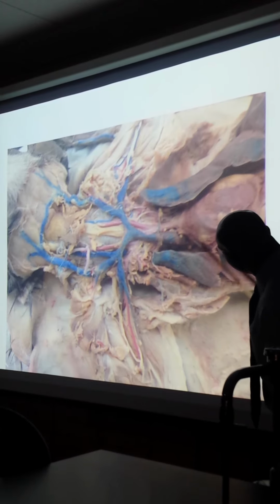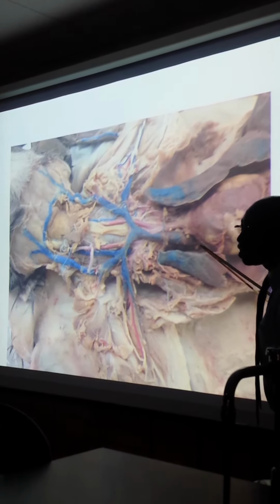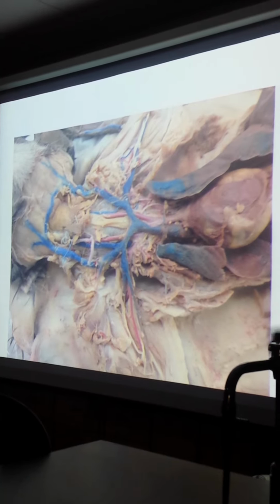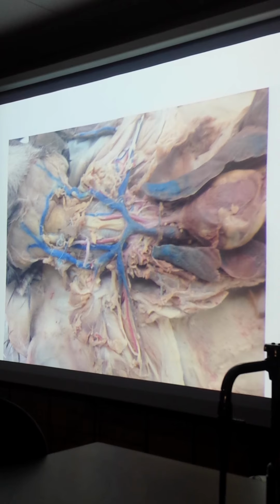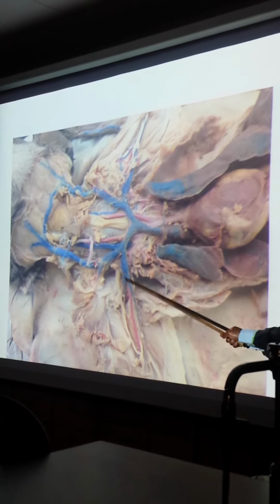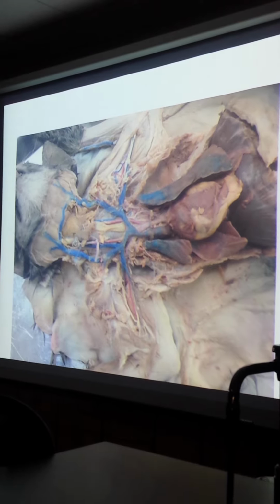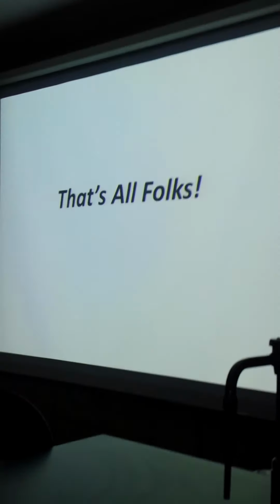Alright? And this time I didn't put my little pin or my little probe for that azygos vein because it comes right out. As soon as the superior vena cava exits the heart, then boom, that azygos comes out. Okay, and then of course brachial artery and vein, of course axillary, subscapular artery and vein, and so forth. So repetitive. Again, we saw this, and then I'll put this up there, and that's it.